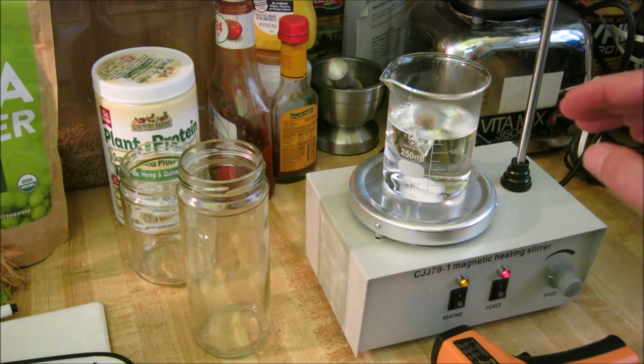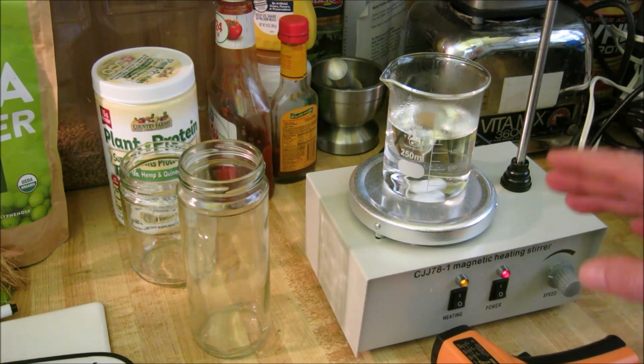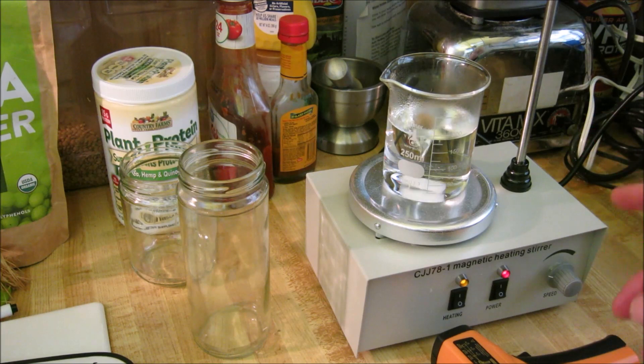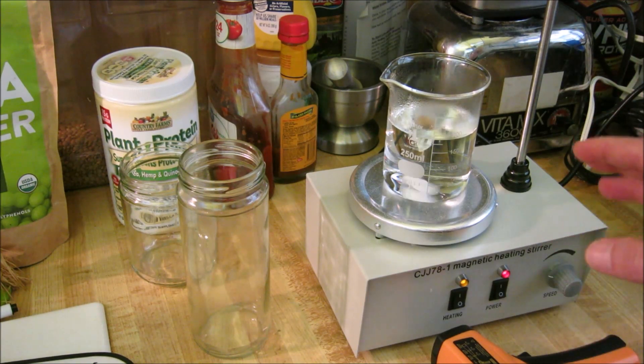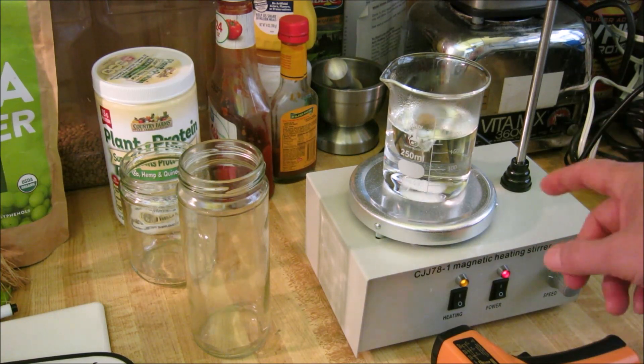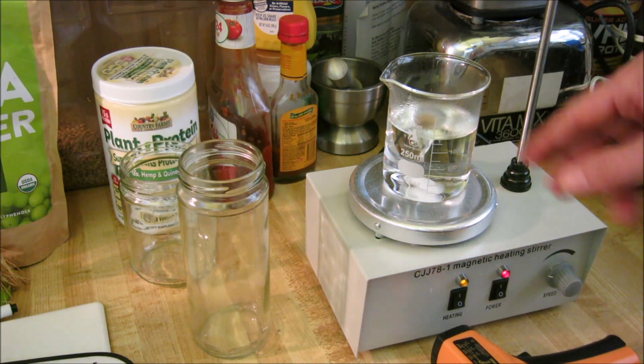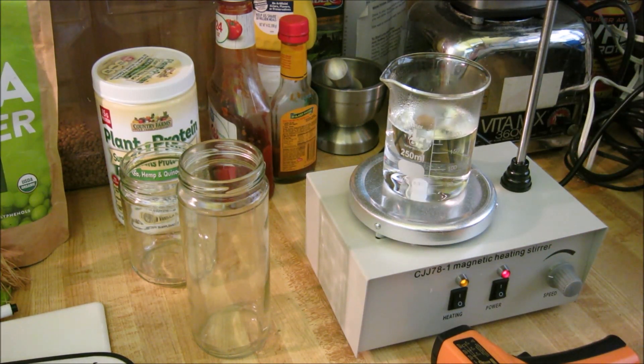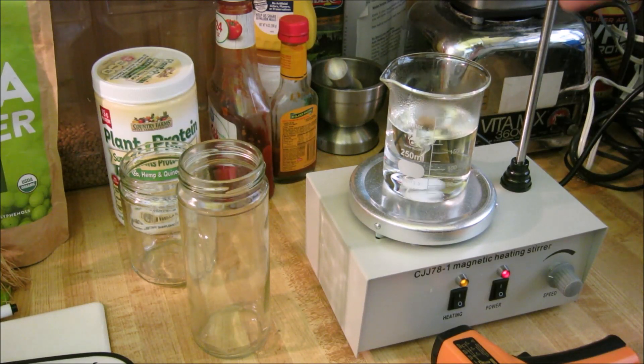But if you're just trying to get a solution with moderate temperatures, this is a good thing. If you're making colloidal silver or e-juice for vaping, this is an excellent device because you're going to have constant stirring. It also comes with a holder for holding temperature probes or analytical equipment on top.